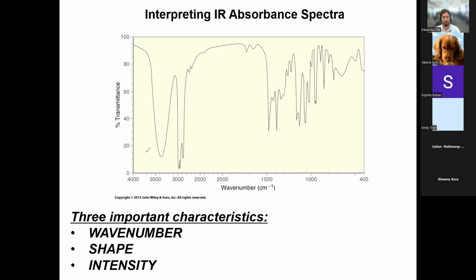So I'm going to bring your attention first to this peak that is located between 3,500 and 3,300 right here. You will notice that this peak is kind of broad, right? You can describe this peak as broad. We say broad, or you can say wide. I apologize for my writing. I am using the mouse. So you can call this a broad peak compared to this one.